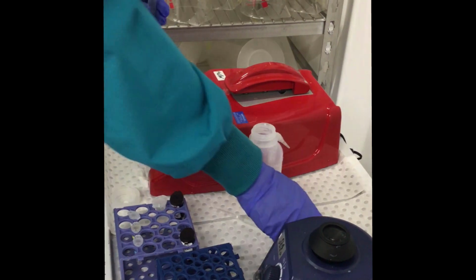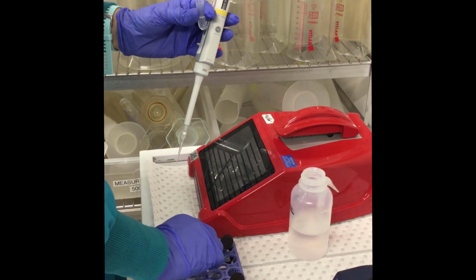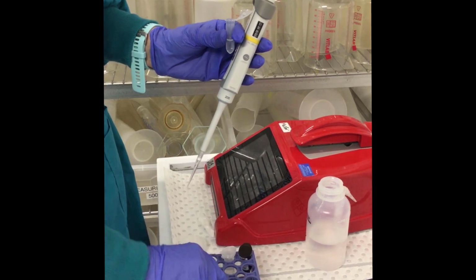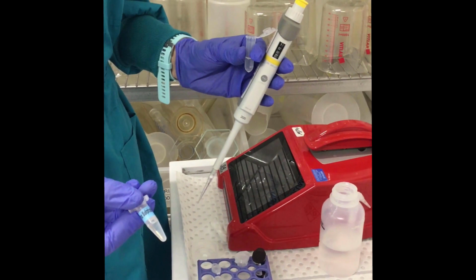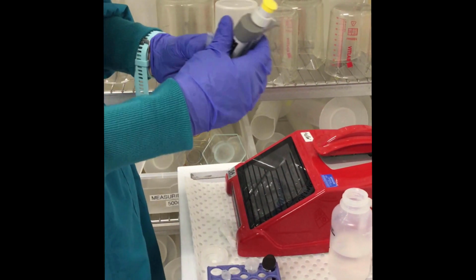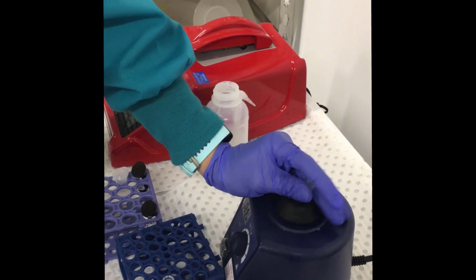So the vortexing steps are really, really important. You need to ensure that each step your sample is mixed thoroughly before you add the next solution. If you don't do that, your solution won't work properly. We're then going to add 100 microlitres of sodium hydroxide, and then after another mix we're going to add 100 microlitres of our zinc sulfate. And it's very important that they're done in that order. That's correct. And give it another mix.